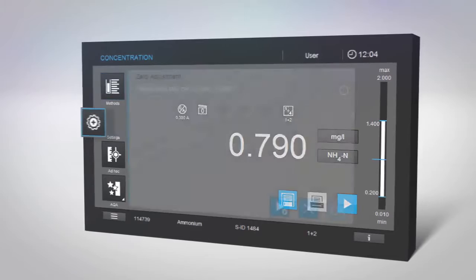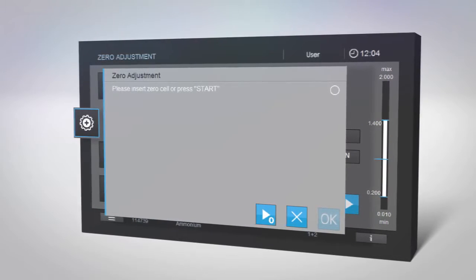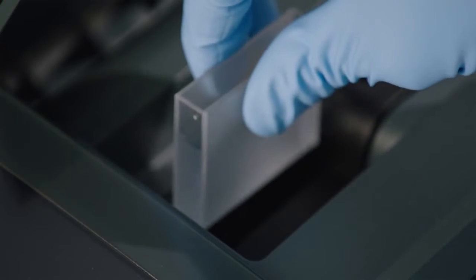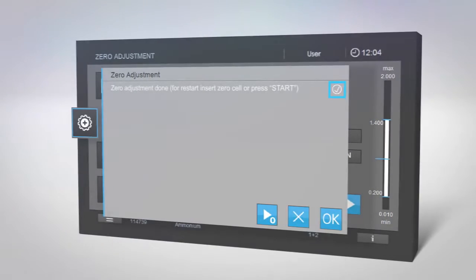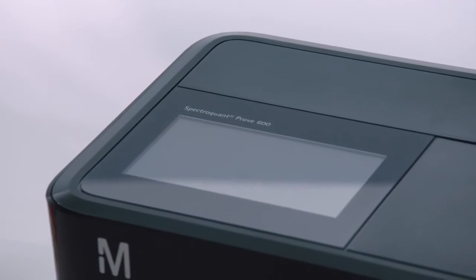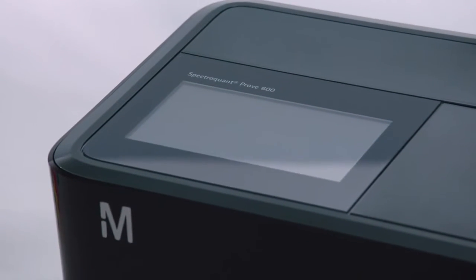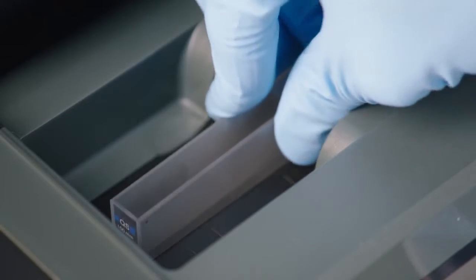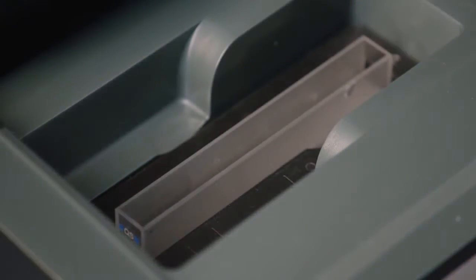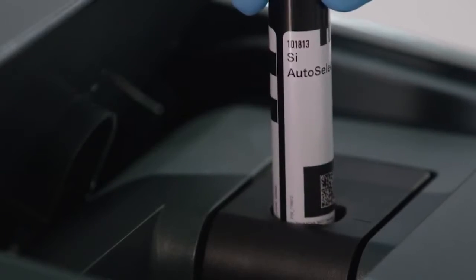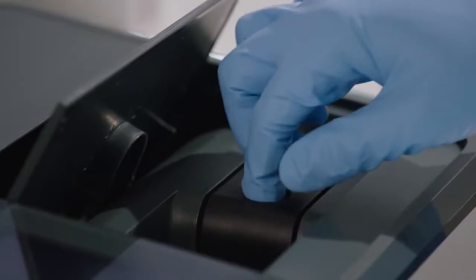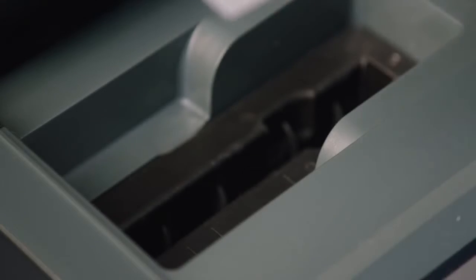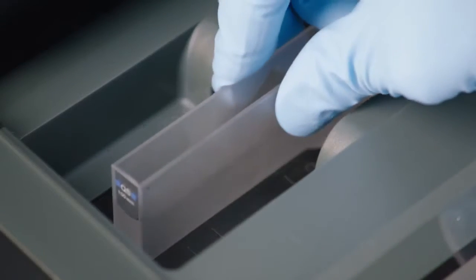If you need to perform zero adjustment, remove the cell with your sample, select zero adjustment, and insert a cuvette with distilled water. The measurement will start immediately. SpectraQuant Prove 600 also offers a more sensitive measuring option using 100mm cuvettes. Insert the auto selector for method recognition as usual. Then remove the auto selector and the round cell holder. Now you can insert your 100mm cuvette and start your analysis.